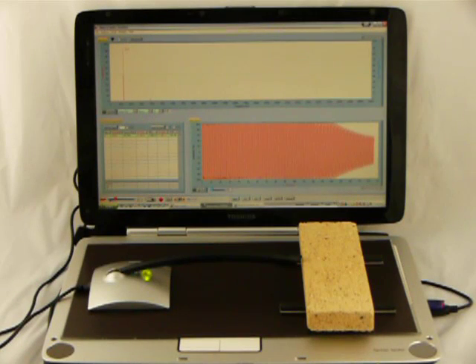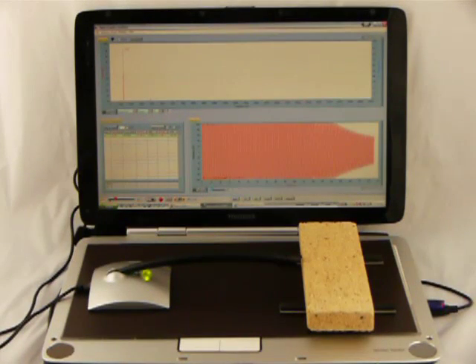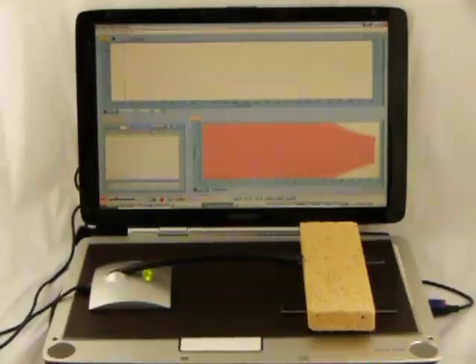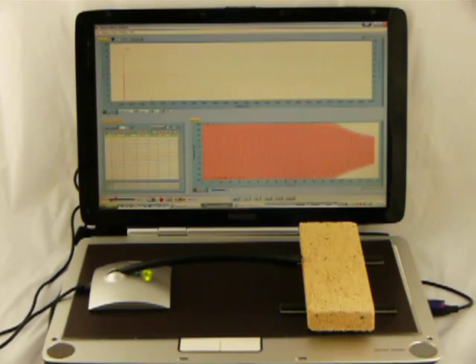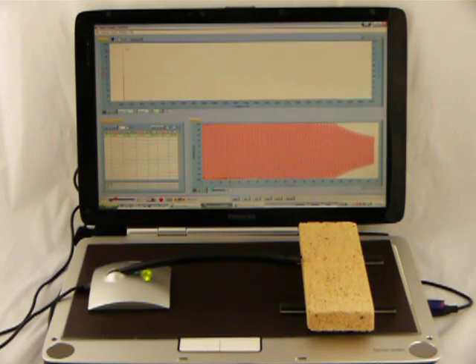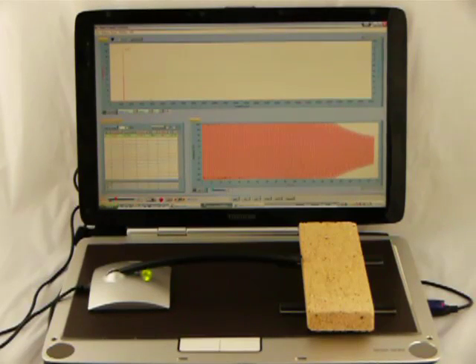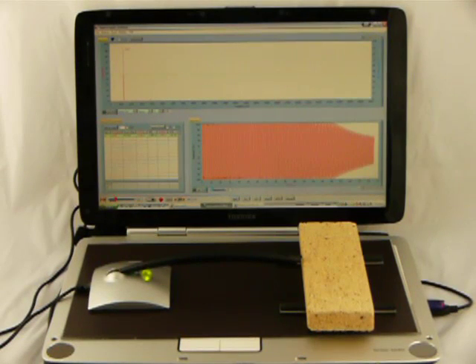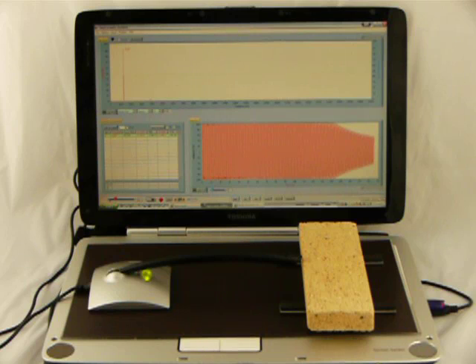If you see the waveform, it's all above the 100% maximum value. So obviously you could turn the gain down on the microphone or just use the lighter impulse tool. In this case we don't need the screwdriver, so let's take that measurement again with a small impulse tool.